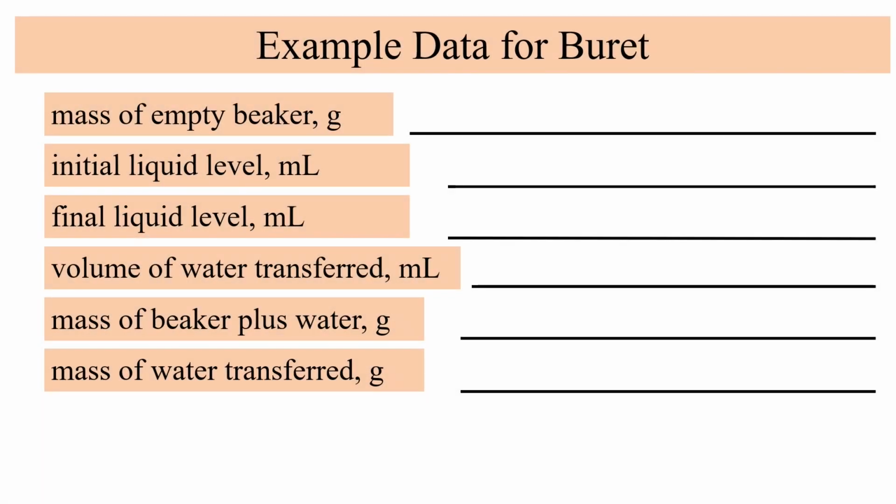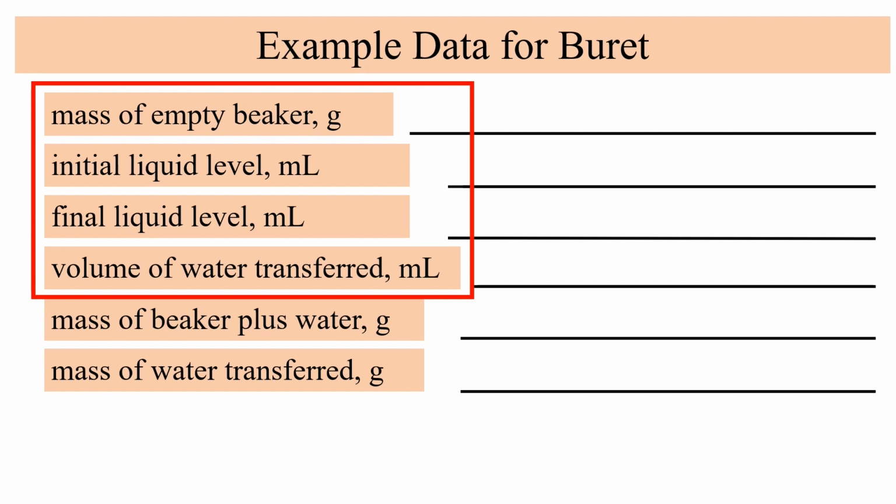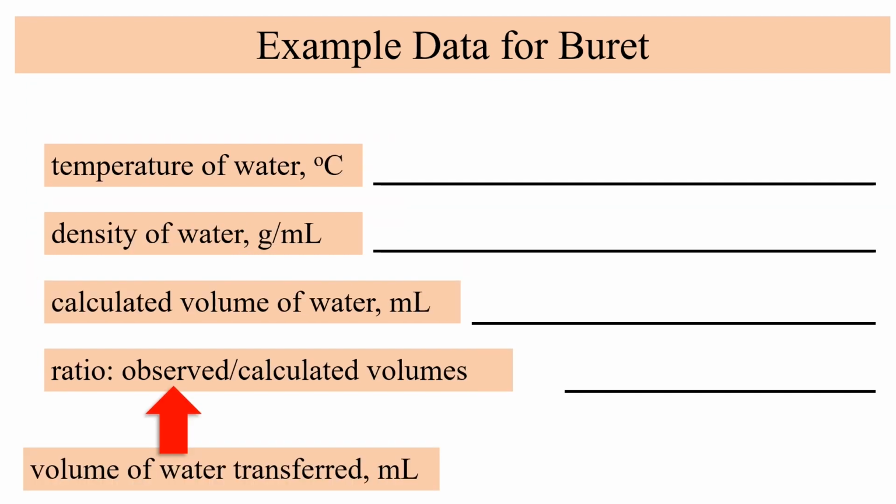Burets are similar to pipets, but with one important difference. Burets deliver liquid to a beaker, and we read the volume delivered from the buret. Notice the initial and final liquid levels must be recorded. The volume transferred in milliliters will be our observed volume. The same procedure is used to find the calculated volume, and you can see the observed volume is the volume transferred from the buret. Now, let's look at the buret data collection.